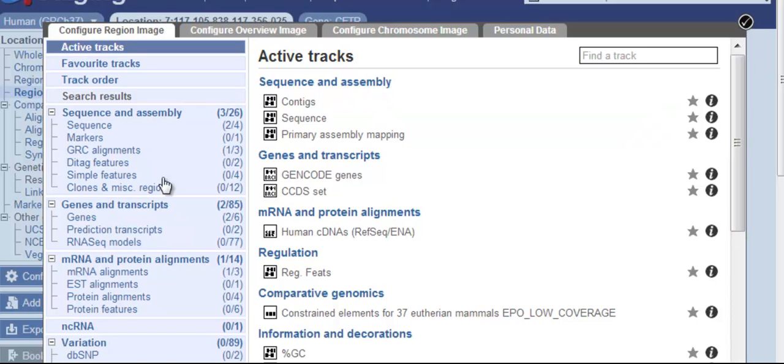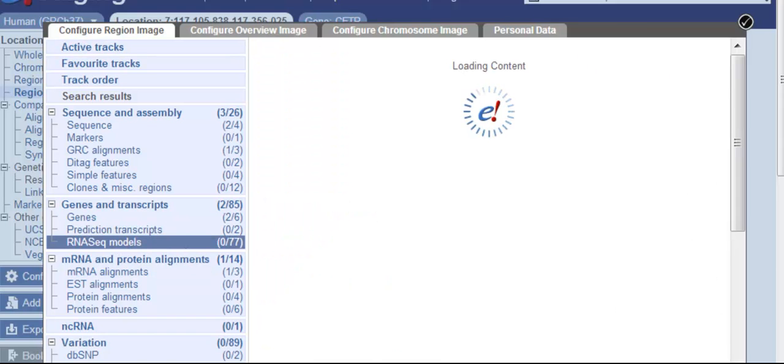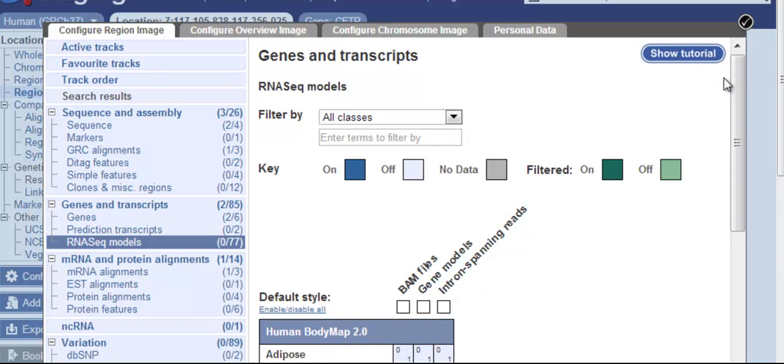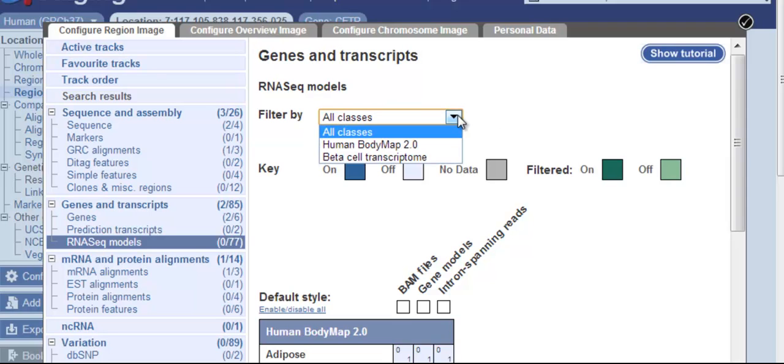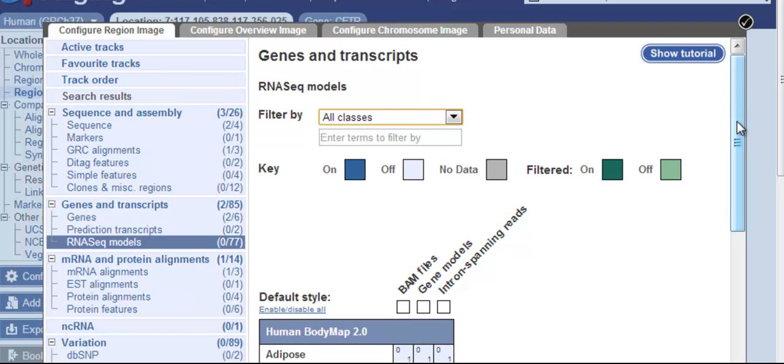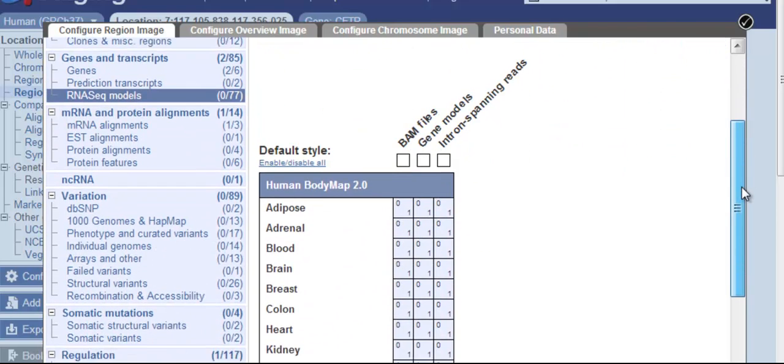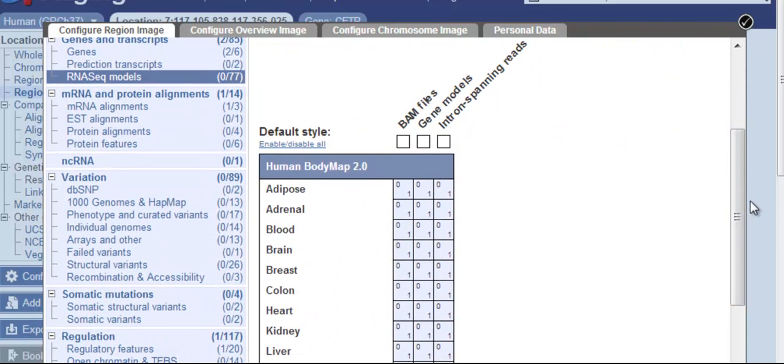To turn on RNA-seq models, a matrix is available. If I click on RNA-seq models, this will reveal the matrix. I'm going to hide the tutorial and walk you through it. First, you can choose by class. In this case, human body map data or beta cell transcriptome. Scrolling down, I can see a list of tissue types.